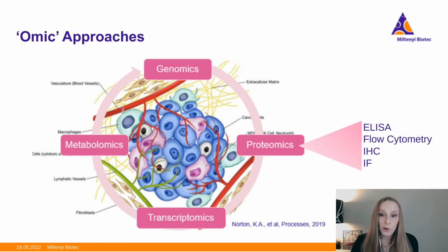Now, in the world of proteomics, which is where I'm going to be spending most of the talk today, there are some really common techniques that you've used and probably even used some automation in, including ELISAs and flow cytometry.